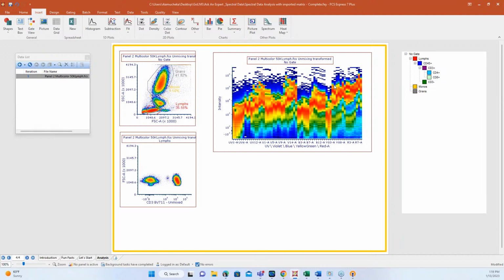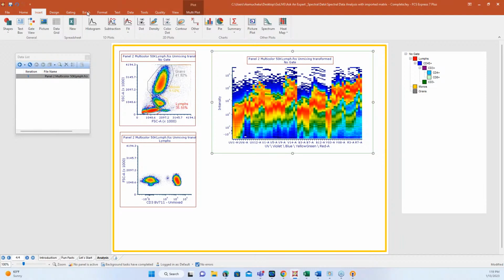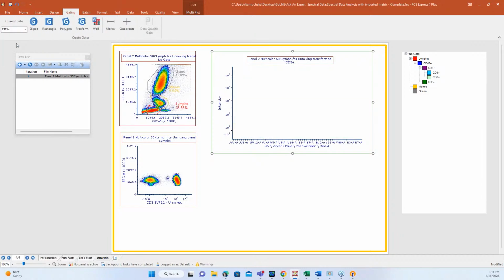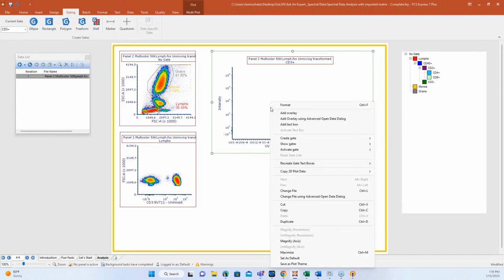And we can probably show here how you can still gate on things. You can take a spectral plot, apply a gate to it, and do all of the things you would do with a normal plot. But I really feel like it adds to the visual effect of whatever reports and presentations you're trying to do. So I just really like that piece of it. I just think it really makes things look nice. Absolutely. That's the same thing. And I'm also kind of a color fan. I love colors, and we get to play a lot with colors here. Let me see what happened here.